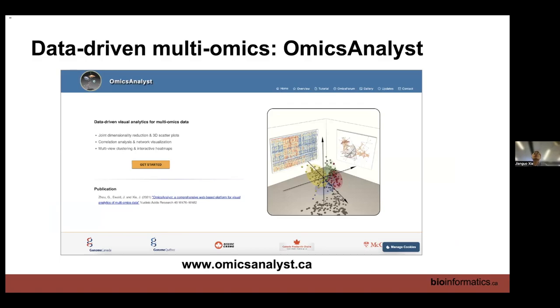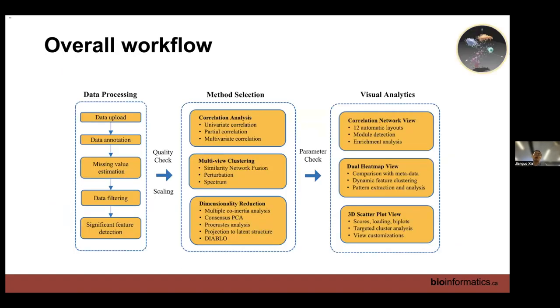So this part is we want people to upload the data matrix to integrate them using a dimensionality reduction and to see them in the same space, see what's the shared patterns. So there's a lot of the algorithm building. For individual omics, we need to process them, identify significant features to really use as a bait, see whether you follow individual omics.